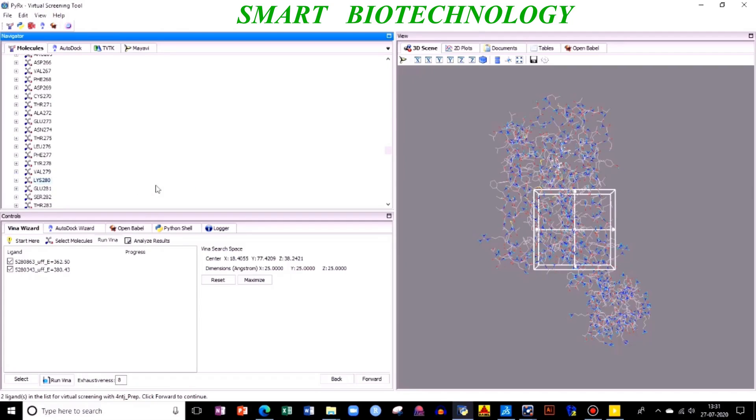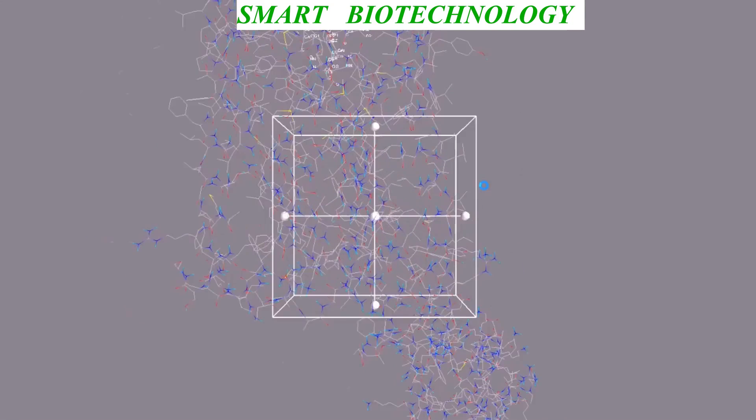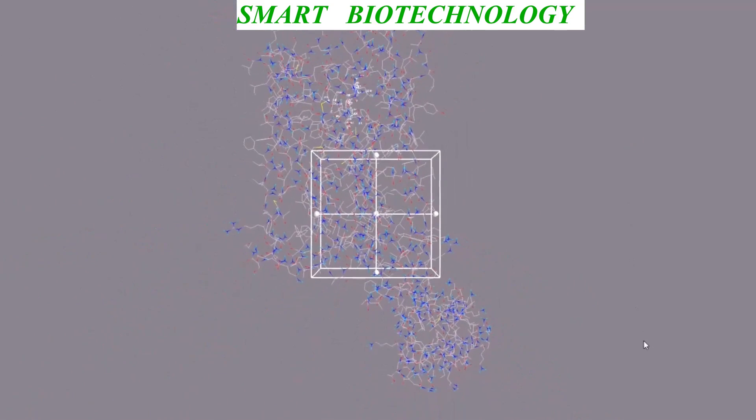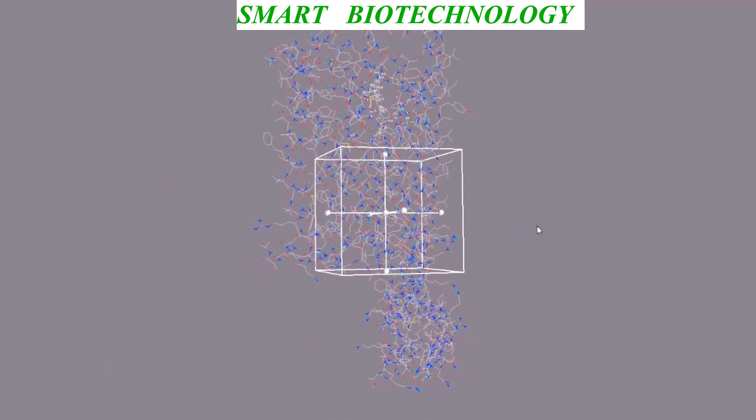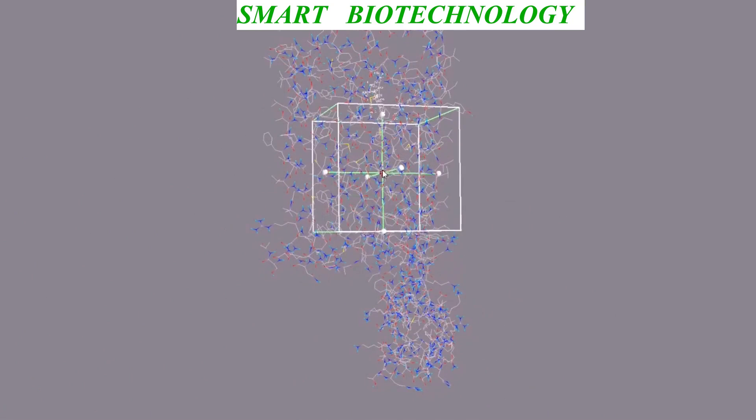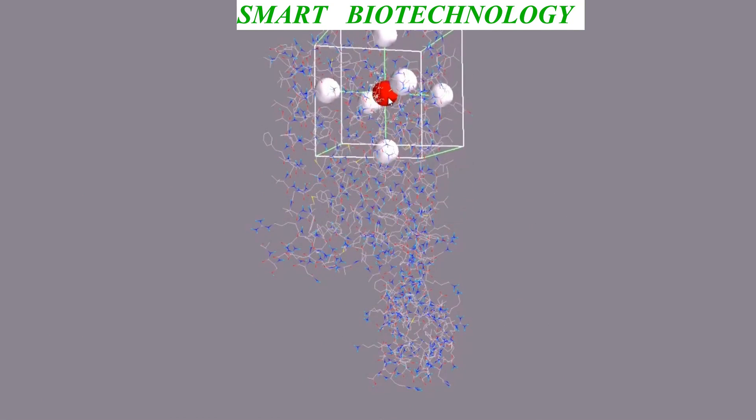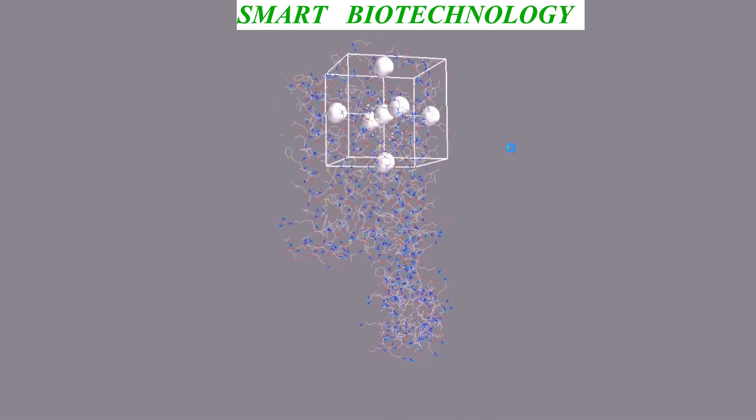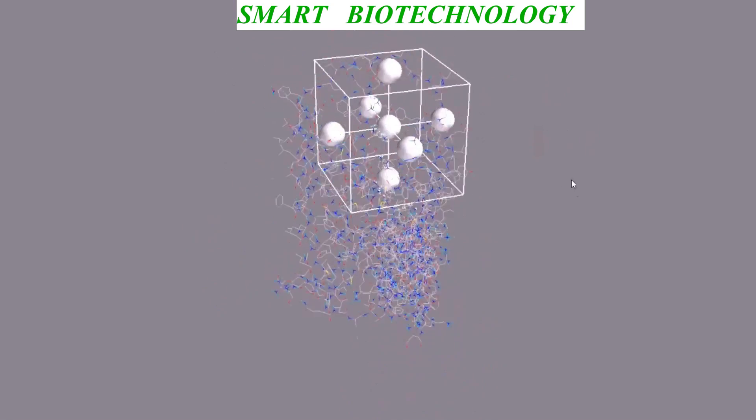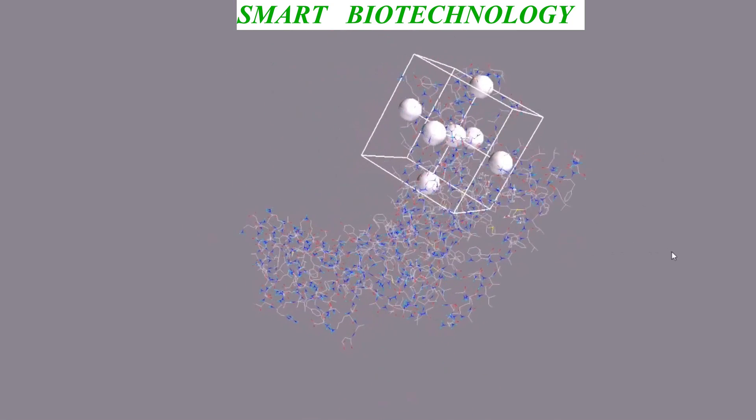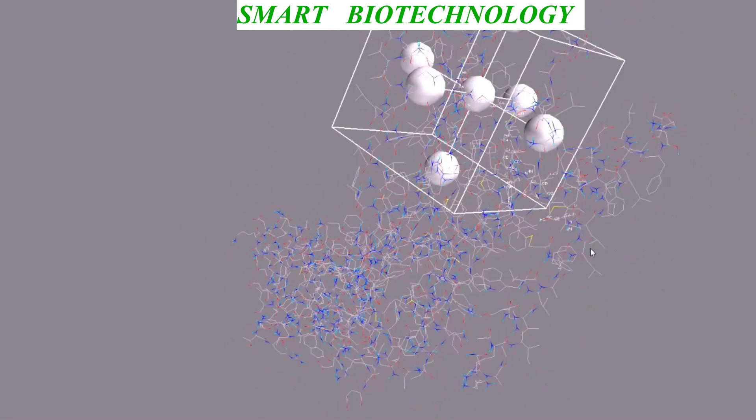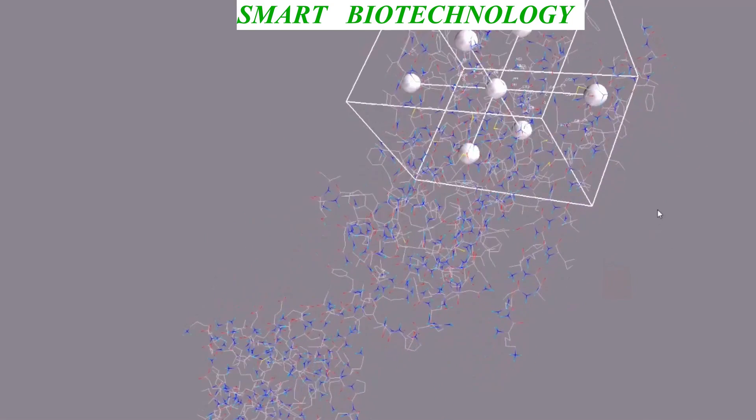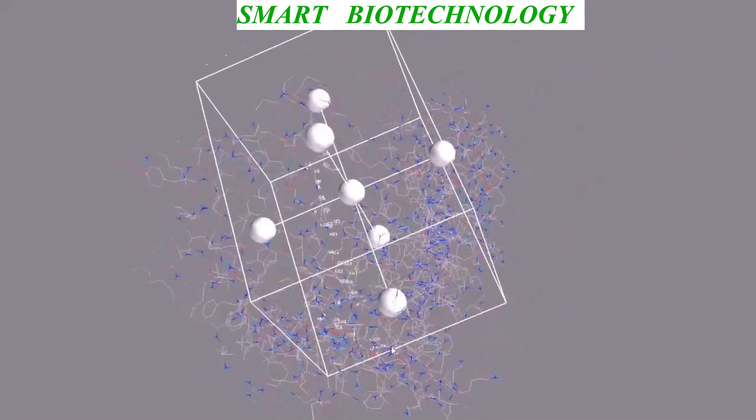After this, you need to enlarge this. You can scroll this. This is a grid parameter. You need to take it here. You need to select your grid based on your binding site for your new ligand. Zoom it, you need to do like this.